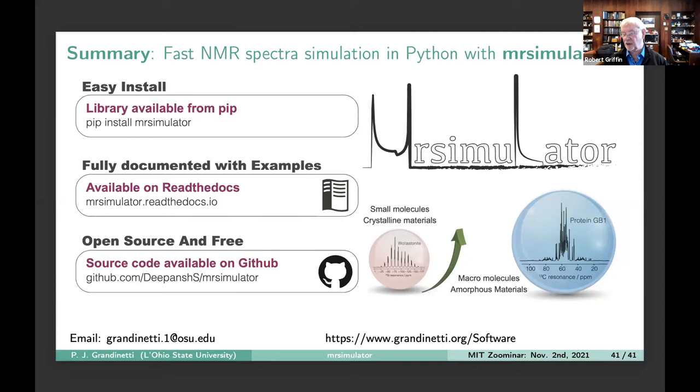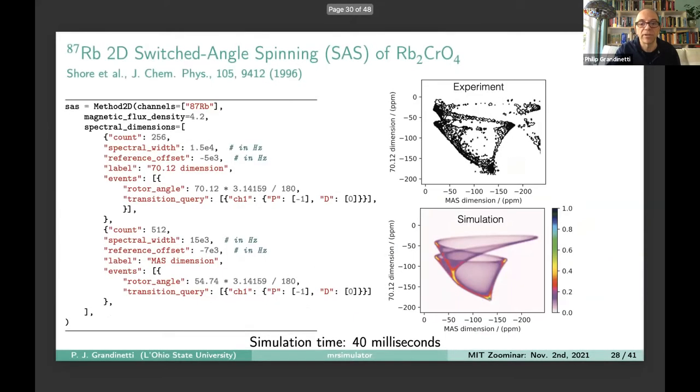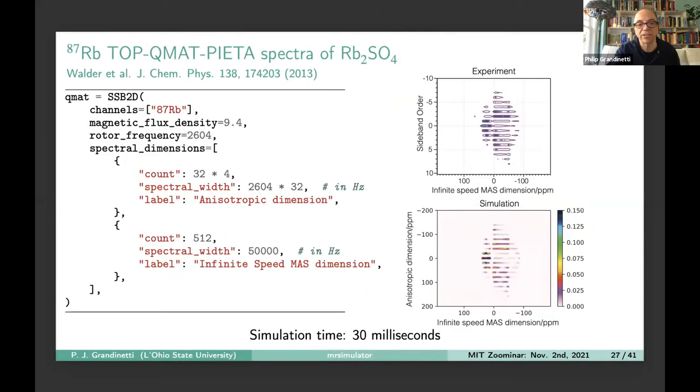Yeah, okay. All right, Jeffrey has a question. How do you implement phase cycling? Well, phase cycling, in a sense, is pathway selection, right? And that's where we have what we call transition queries, where you can use different transition symmetries to select the pathway. Something similar is done in Simpson and the other apps too, where you don't actually run the phase cycle, you just select the pathway.